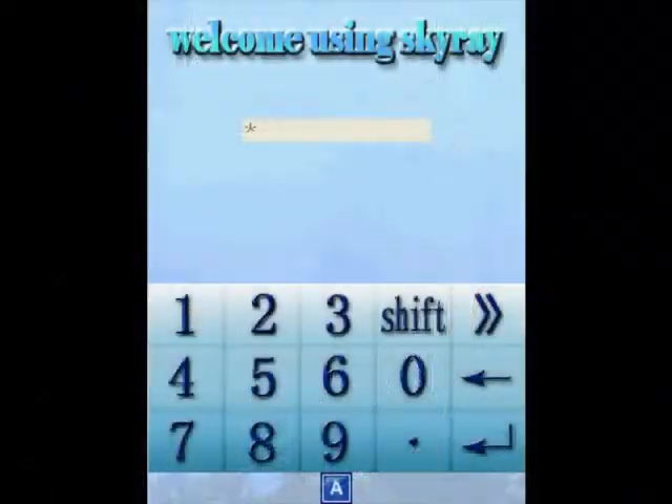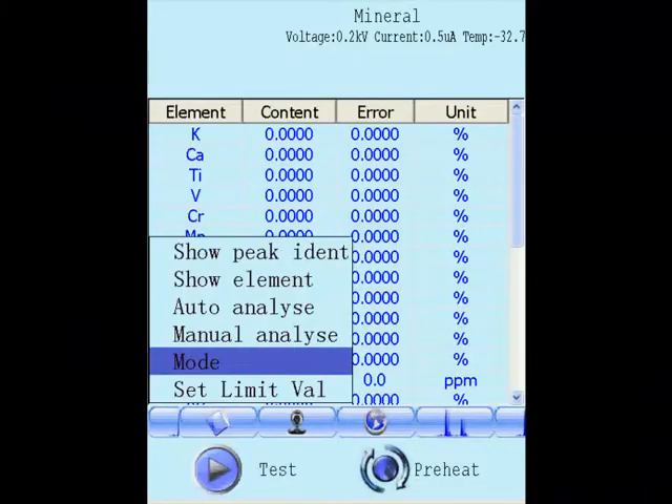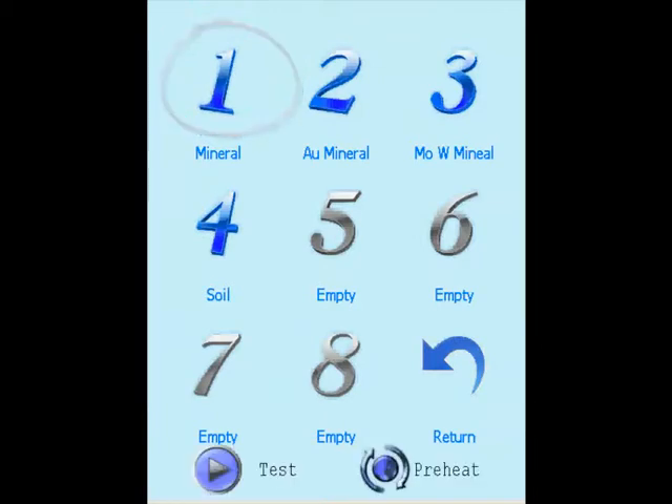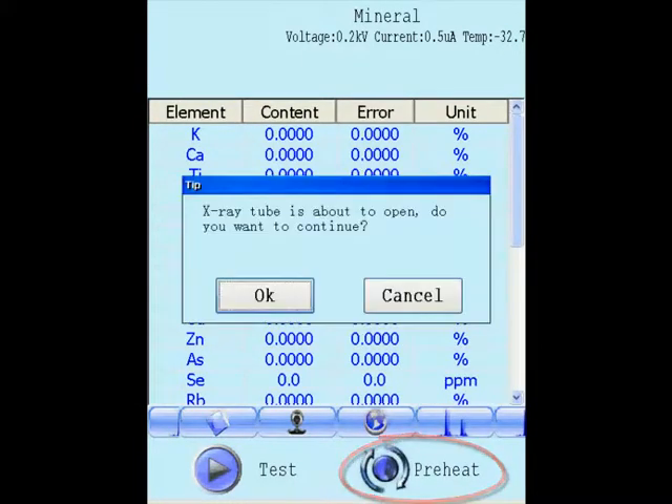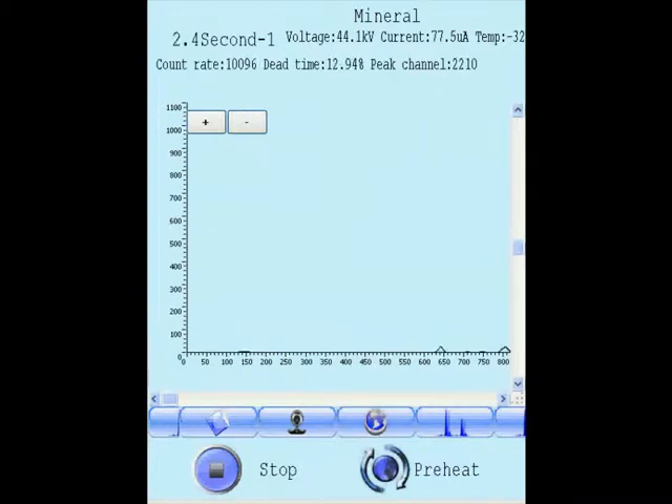Click the leftmost button below and choose Mode. Choose the required curve, for example a manual curve. Press Preheat to initialize the instrument. Note: you do not need to initialize each time you start a test — do it only once after powering on the instrument.